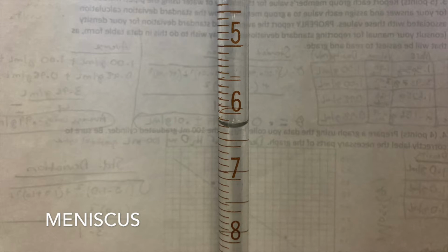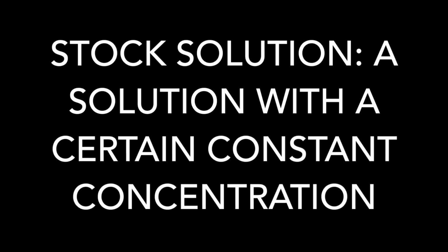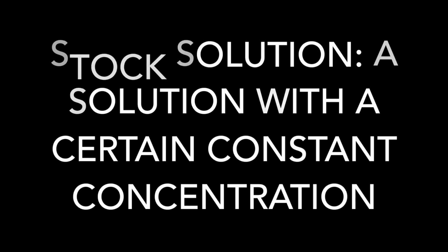All volume measurements have to be read from the bottom of the meniscus. In this particular example, the volume would be 6.20 milliliters. Next, we have the definition of what a stock solution is. A stock solution is a solution with a certain constant concentration.